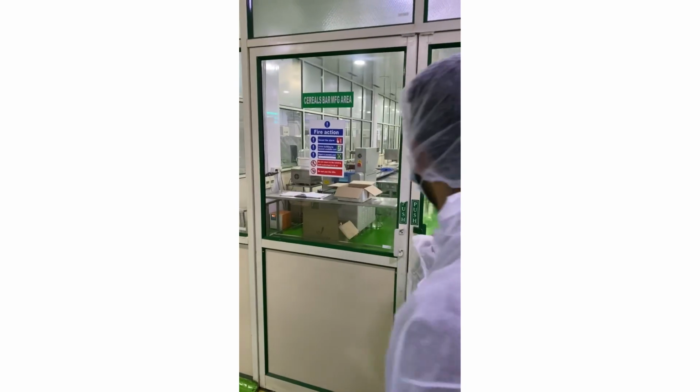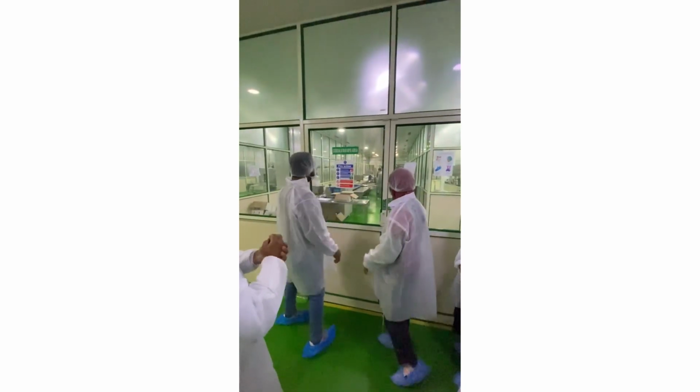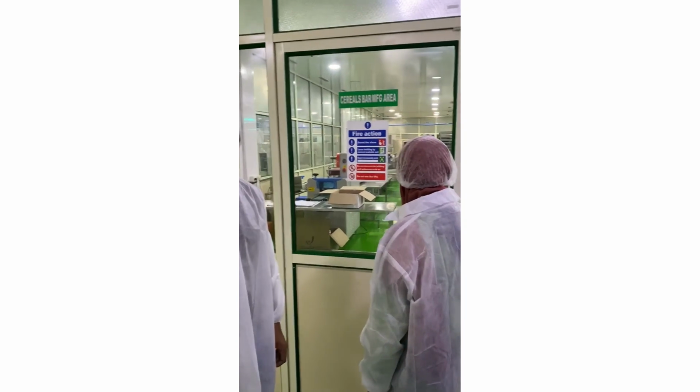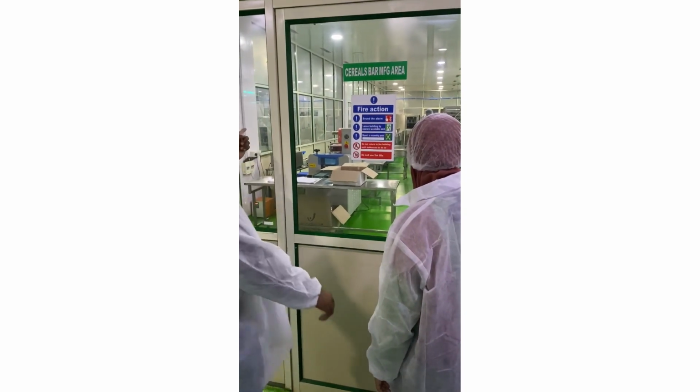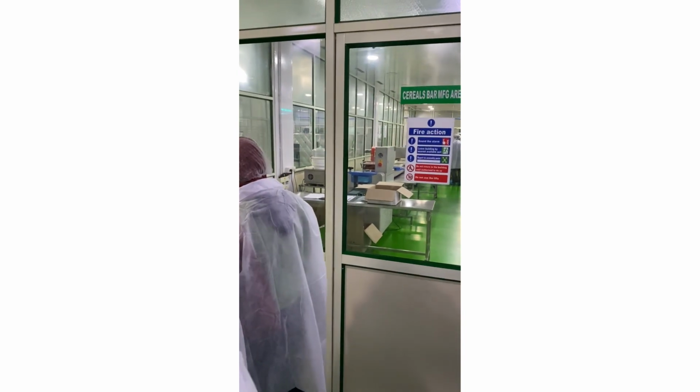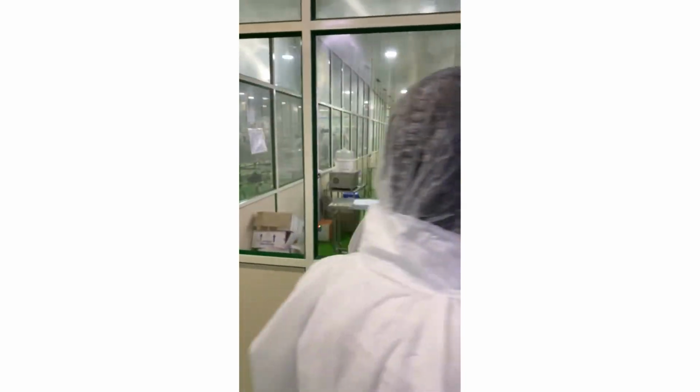Actually, now it is lunch time in the market. Bangalore went for lunch. So today we are running the orange variant. It will be the same process you follow in beverages here. All the raw materials get analyzed, approved and documented, then dispensed.